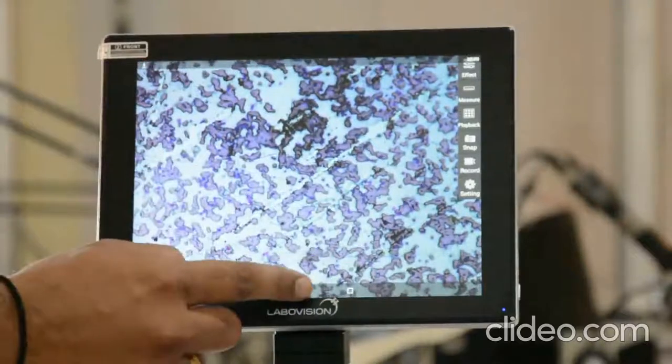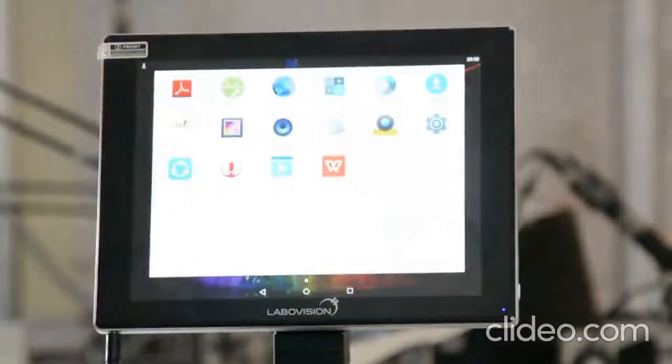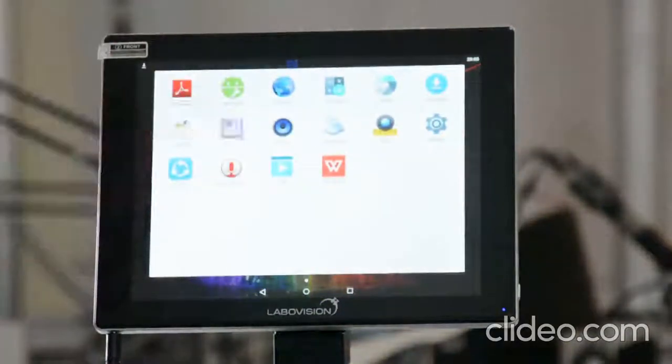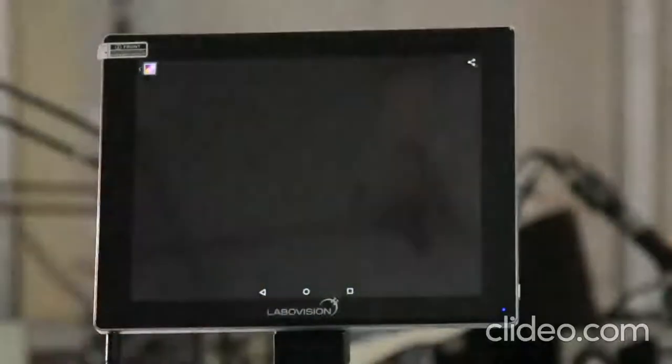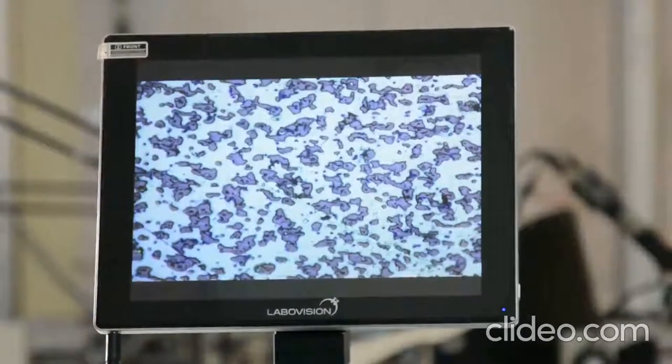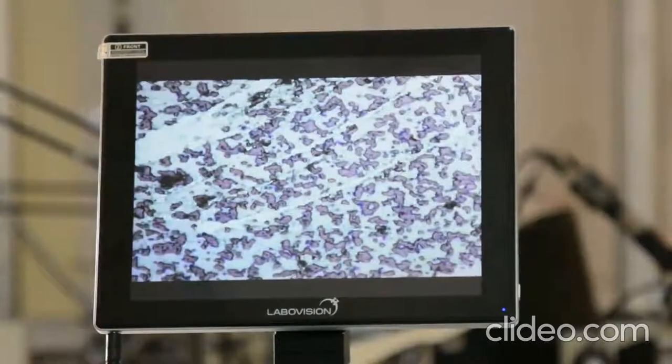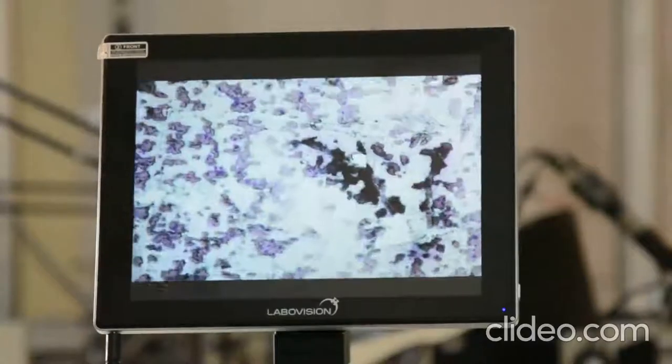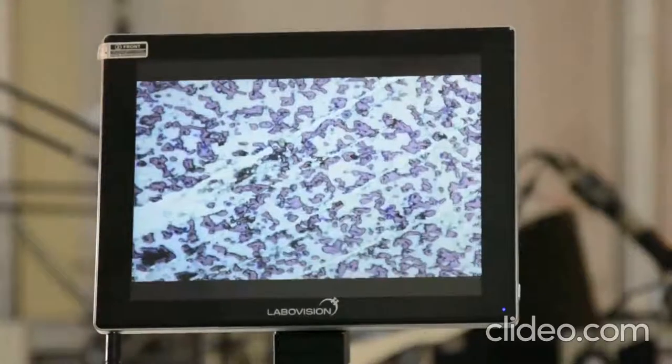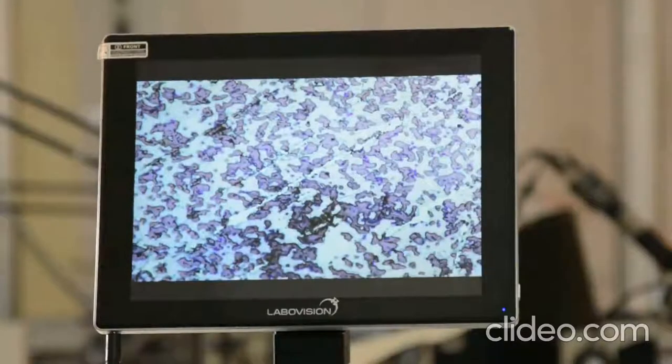Similarly you can see the video from the photo folder. As you see, you can play this video. As you see, I was actually presenting the features of the LCD screen. You can see my voice has been captured by the LCD. And this is the video which has been played from the photo folder here.